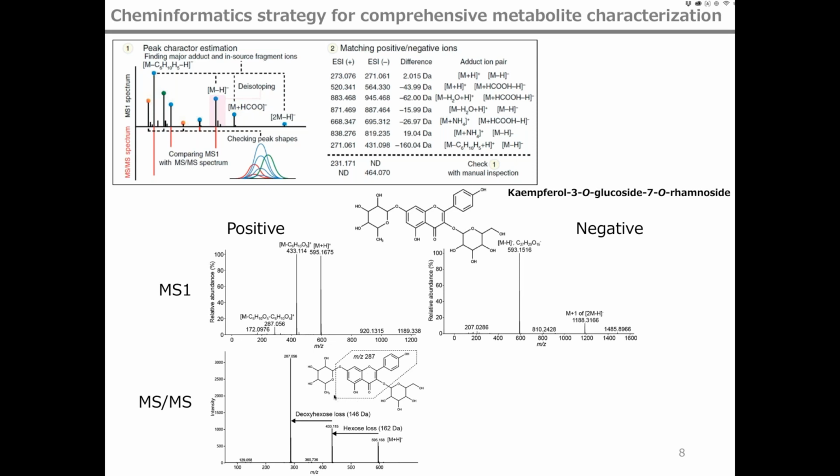Furthermore, we can also determine the adduct type by looking at the mass difference between negative and positive ion mode.